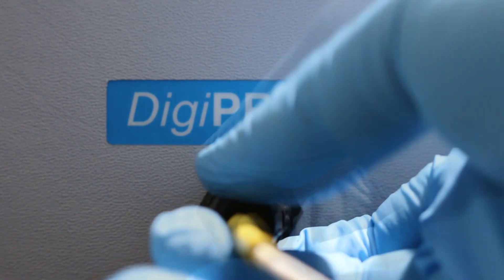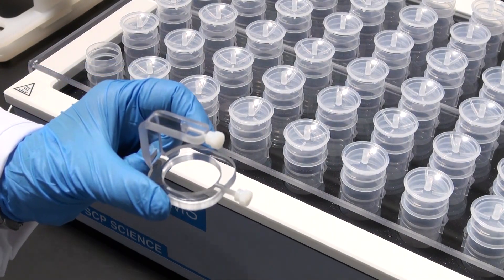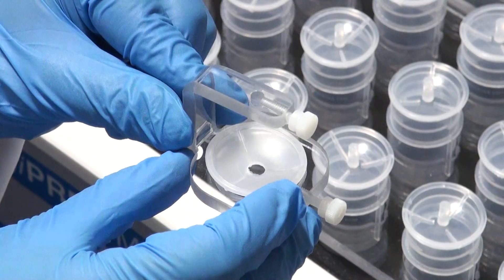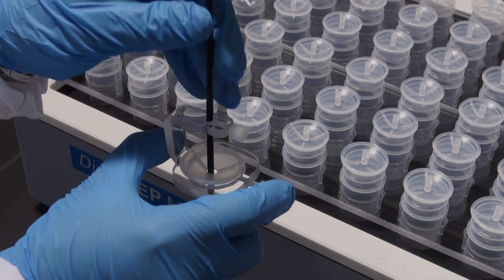Digiprobe is very effective in ensuring temperature consistency during the entire digestion process. Digiprobe is a PFA-coated temperature probe which provides direct control and monitoring of the sample temperature.